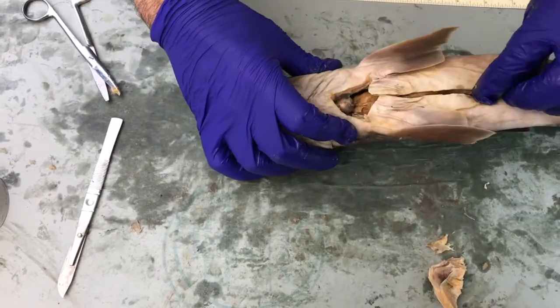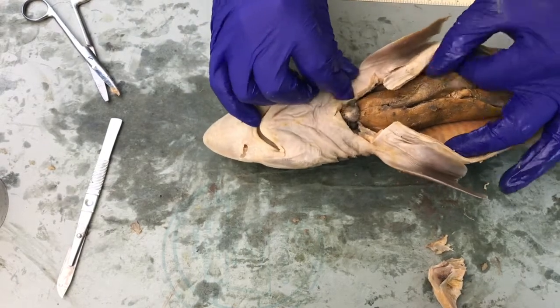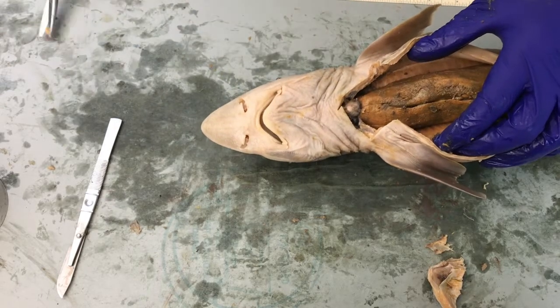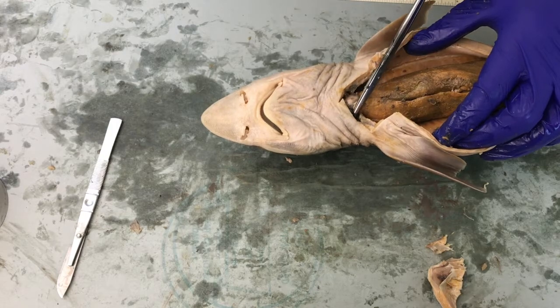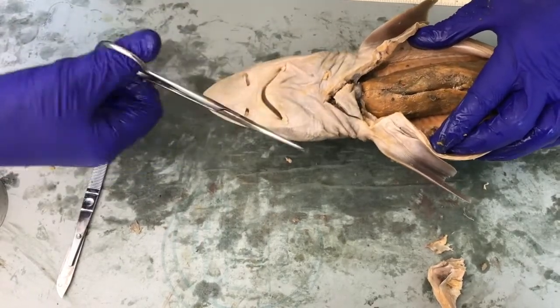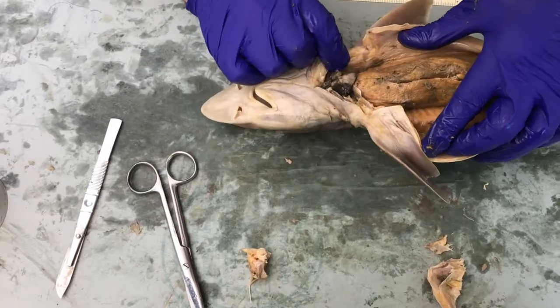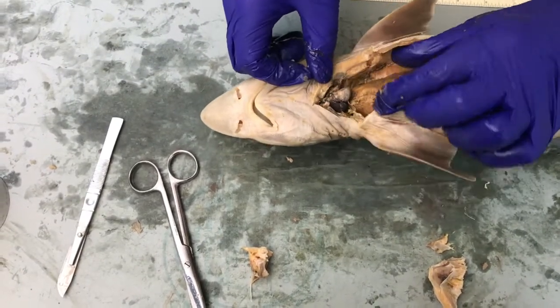Opened it up a little closer to the head, and one of the things that cartilage bar was protecting was the heart. So I see the ventricle of the heart, which is right there, and the darker section in the back is the atrium. Of course, these guys just have a two-chambered heart. And we have a four-chambered heart, right? We have two atria and two ventricles. So they collect the blood in the atrium.